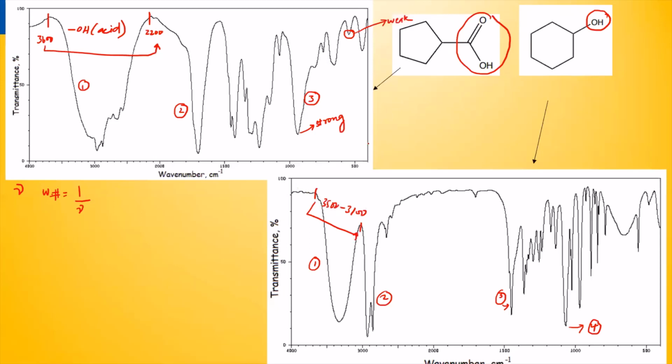So right away we know this. There is another important aspect, which is this peak. Say you still can't figure it out. As I said, go to the second big one, which is this. This peak is at around 1700 almost.